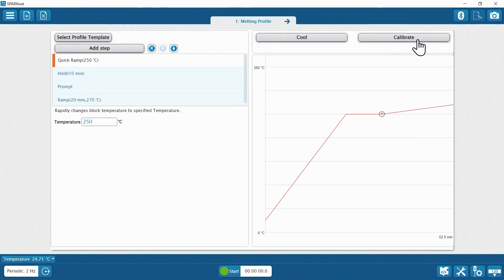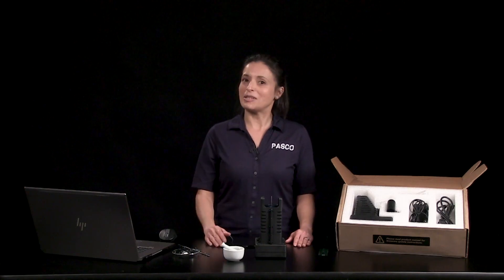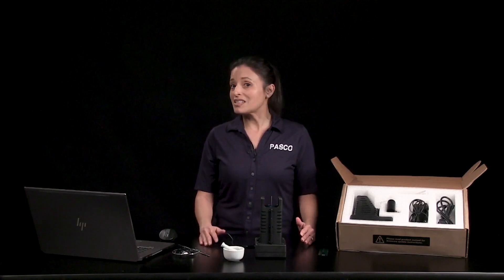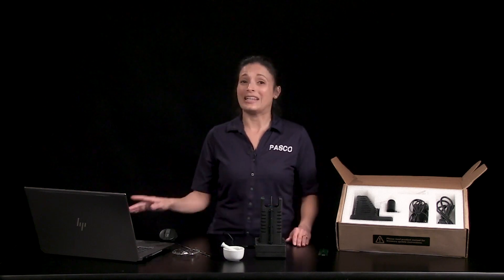You can calibrate the unit to get optimum performance under local laboratory conditions if desired. When you select each profile step, a brief description of its purpose is shown below the profile. Quick ramp is meant to quickly heat the sample to a temperature just below where you expect melting to start. Hold is meant to pause heating and maintain the quick ramp temperature to make sure the system reaches temperature equilibrium. Prompt enables a pop-up window that asks you to click OK to make sure your attention is on the apparatus before the next step begins.